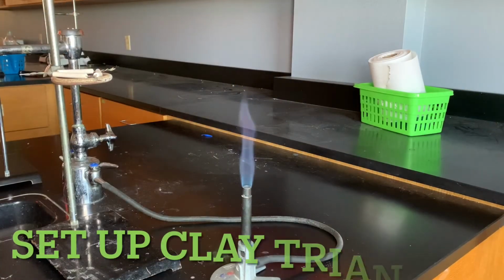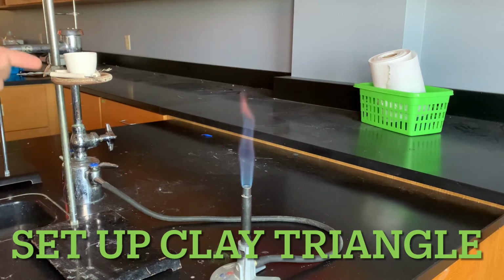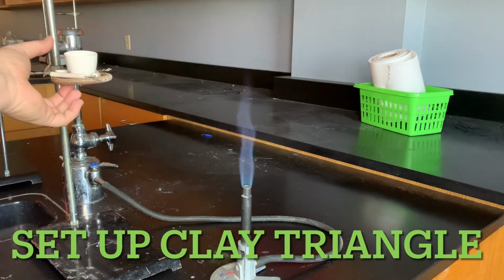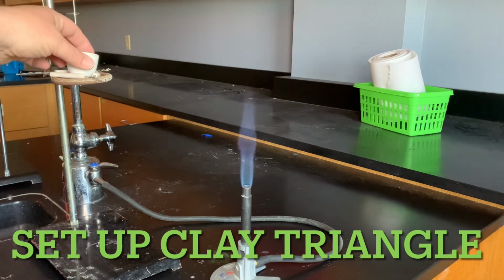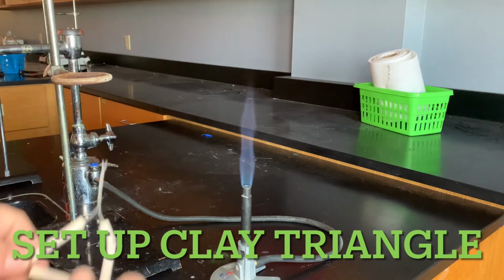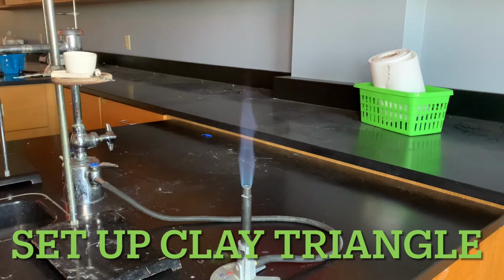Okay, so before I do my next step, I'm going to make sure that I have this set up properly. So I'm going to stick my crucible in there. It's got enough height and it's got enough down here where if I do this, it's not going to fall. If you feel like you don't have enough, then you can go ahead and we can just spin this out a little bit more and it'll sit a little bit further down for you. Okay. But this is how it should be positioned with the clay triangle and the ring.